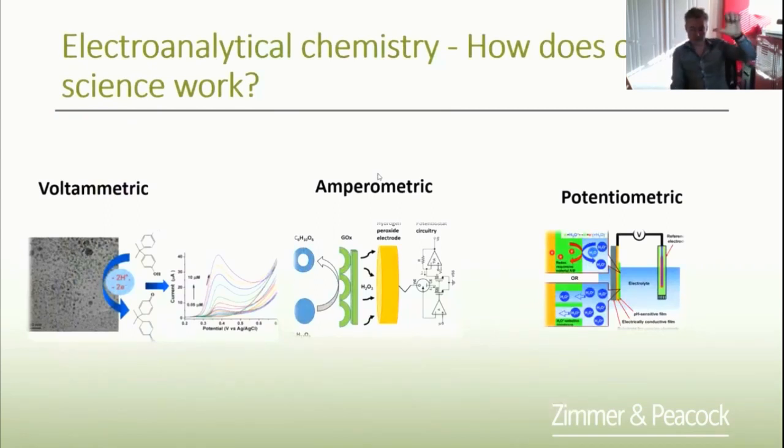So we've said there's a subject called electrochemistry. It is economically very important in this world. Then there's a subtopic to it, which is electroanalytical chemistry, which is what we do at Zimmer and Peacock. And then I want to break into these three terms here that we have: voltammetry, amperometry, and potentiometry. So we are going to do demos on each one of these techniques. And the first demo we're actually going to do is voltammetry.